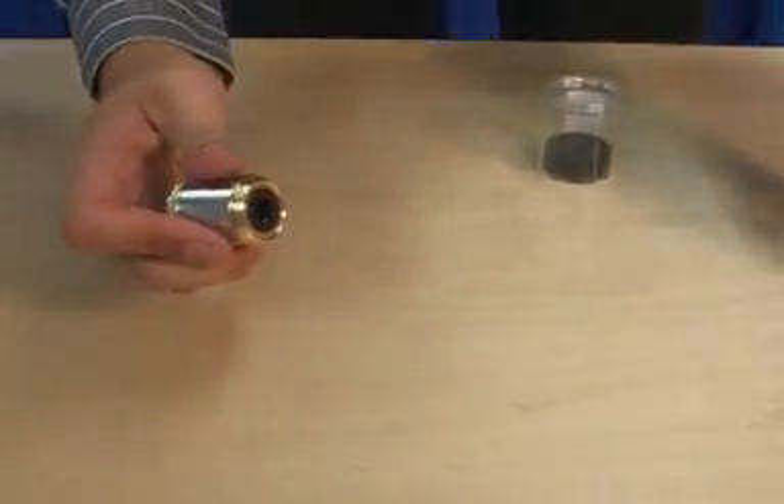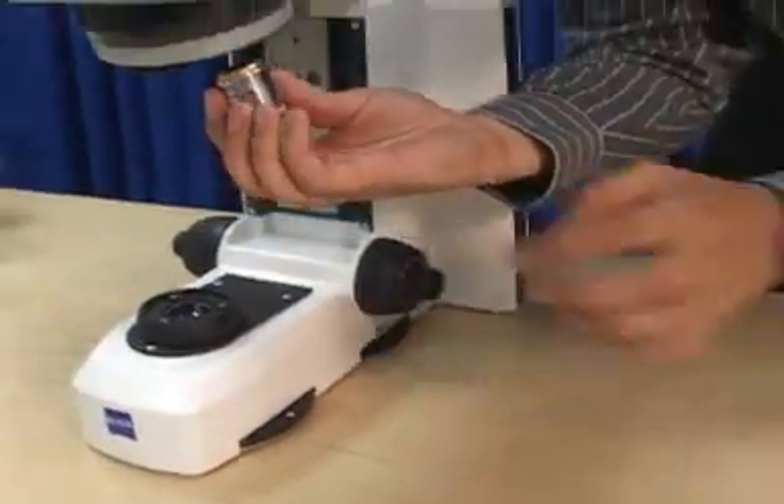Remove the objectives from their containers and screw them into the nosepiece holes in ascending order of magnification.